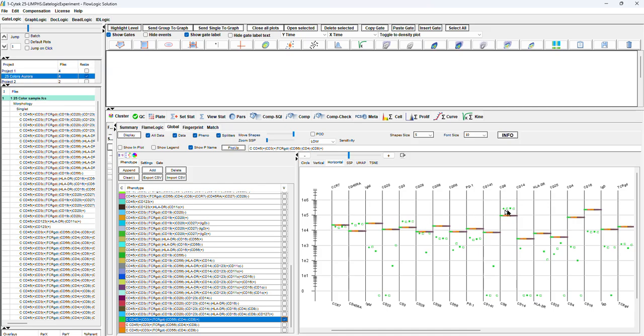So here we compare the result of our CD8 in all 4 files. And we can compare the result of our CD4 as well. You can see here positive, negative. We can see the CD3, how CD3 is expressed. And this is data from the phenotype that we extracted. So it's gated data.